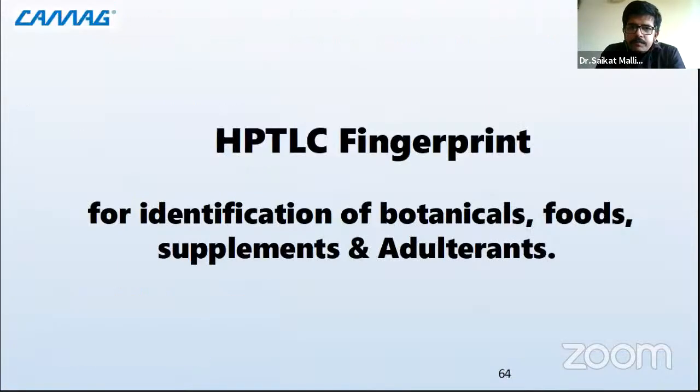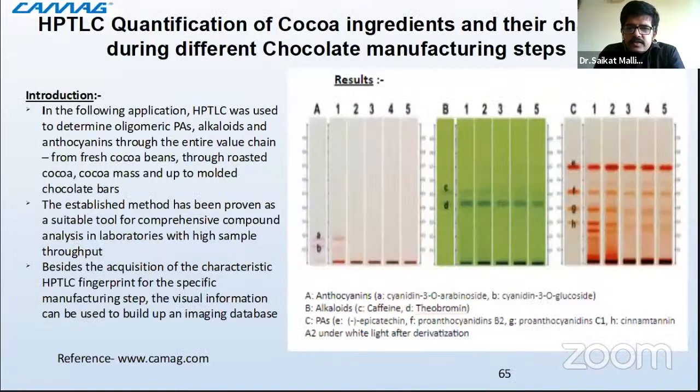So now, this is about understanding what is happening at what stage. As I told you, in drug discovery, one of the important aspects is this: I have a plant which is growing in summer. That same plant in winter, its leaves are gone, but the plant is alive. And then again in the rainy season, it comes back. So what is happening chemically, and how can you find that out?